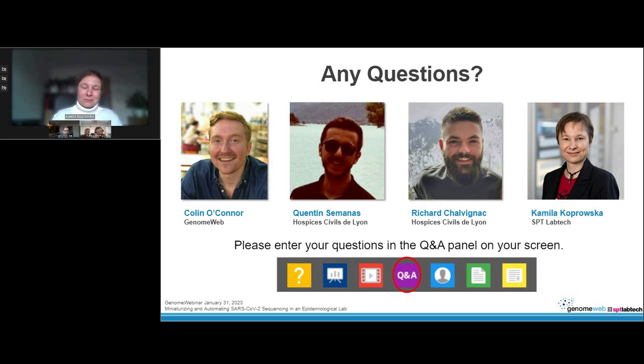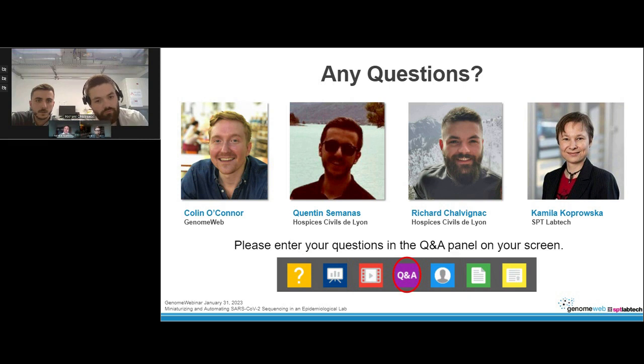Yeah, so as Camila said, the software is quite friendly. It's quite easy to use, and you can basically modify the program right in front of the machine and do everything you want to test different programs and conditions. So as Camila said, everything is on the computer, and it's quite easy to use, easy to master, and you can just play with it and find a solution that works.